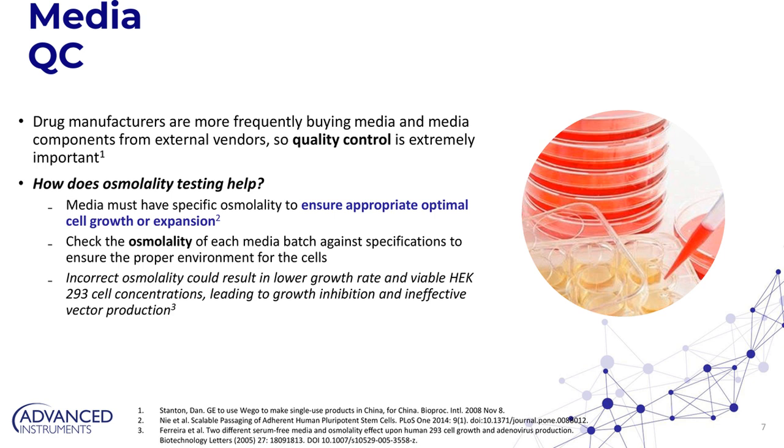If that's something that you are familiar with or have experience with, we would love to hear more about that. Feel free to drop us a comment in the question section. But this is definitely one of the use cases that we see is gaining popularity for osmolality testing. So that's media.